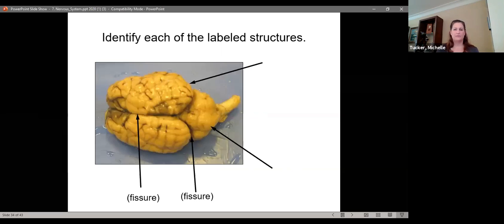Okay, go ahead and put a star on the cerebellum. Oh yeah, it doesn't show up very well. A heart on the longitudinal fissure. An arrow at the transverse fissure. And a question mark on the occipital lobes. Yep. You guys got this.